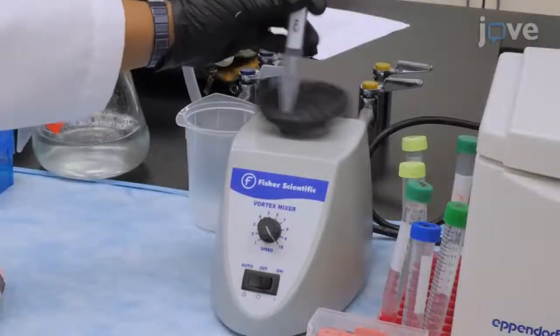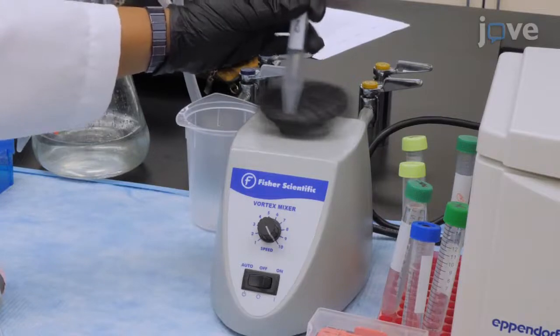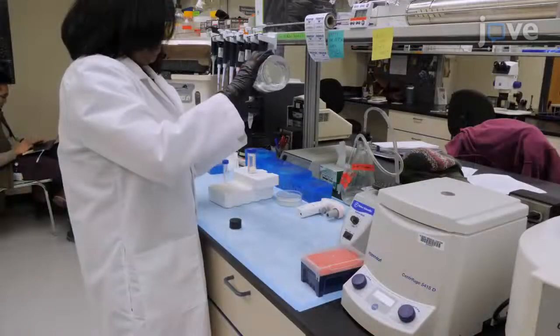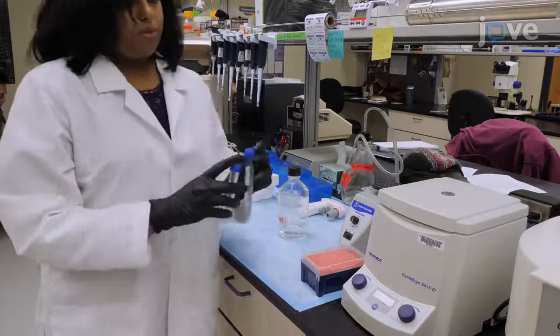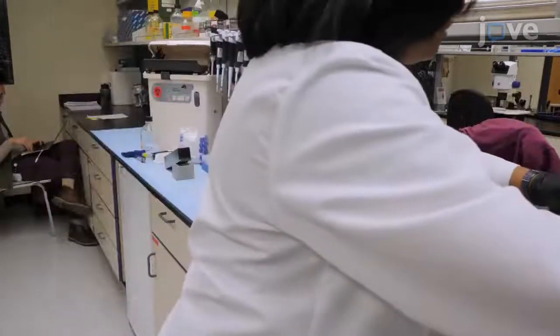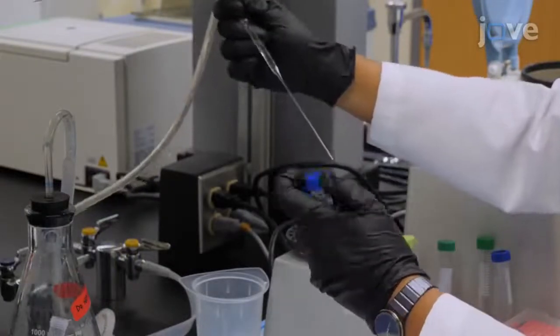Add three to four milliliters of bleach solution to each tube and intermittently vortex for six minutes. Then, add M9 buffer to fill each tube and spin at 6,180 g for one minute. Aspirate the supernatant and repeat this wash with M9 three times.